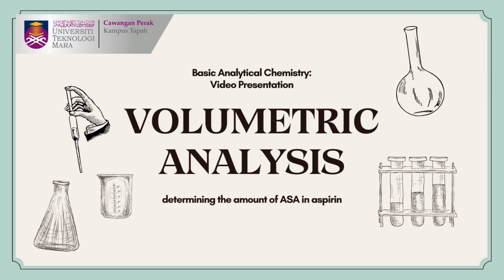Hi ladies and gentlemen, I'm delighted to welcome you to today's presentation on volumetric analysis, specifically focusing on the precise determination of acetyl salicylic acid (ASA) in aspirin tablets.